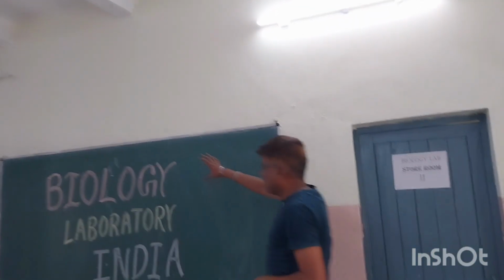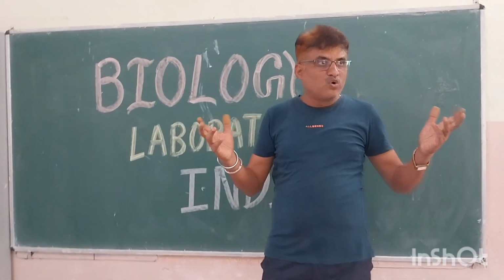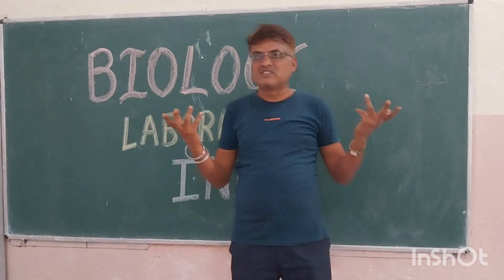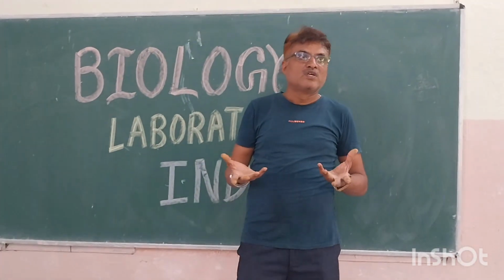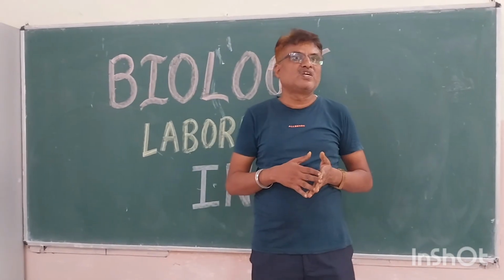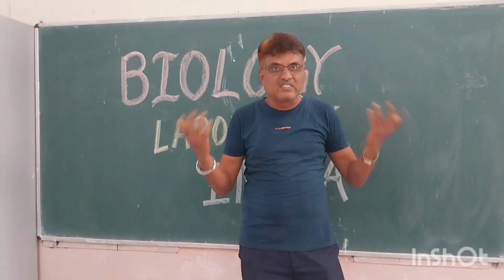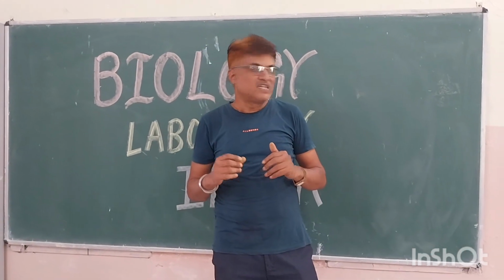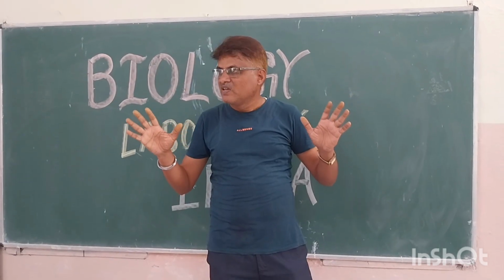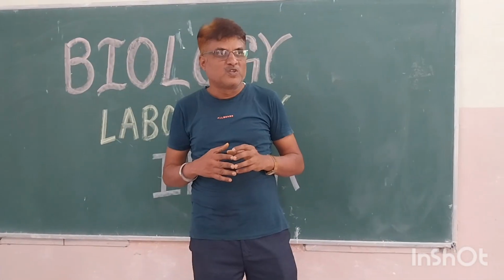In this way we have seen the biology laboratory. This is the typical laboratory in India. We have seen the different things, just like we have seen the charts, models, specimens, soil testing kit, water testing kit. Lots of things are available in the laboratory, and we can study the nature in this way, by studying the biology laboratory. And I hope you enjoyed and are happy with this biological laboratory, and also in your life, and this will be useful to you. Thank you.